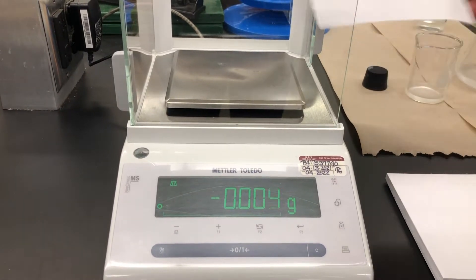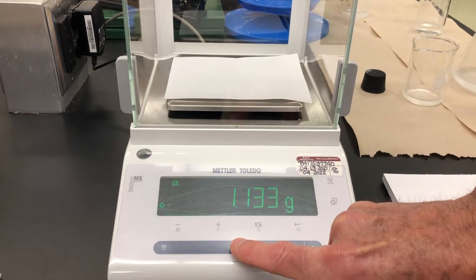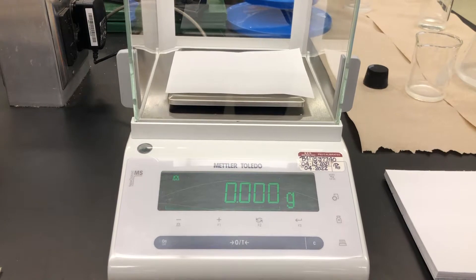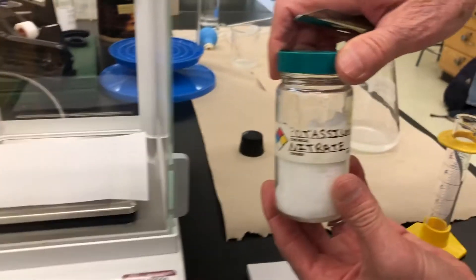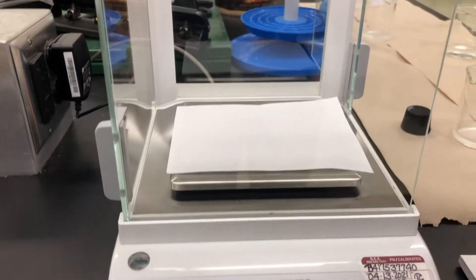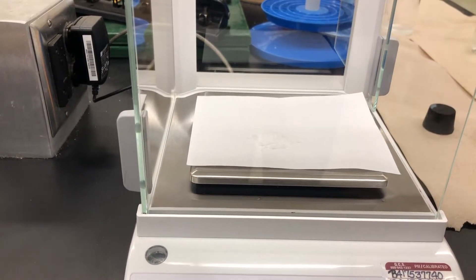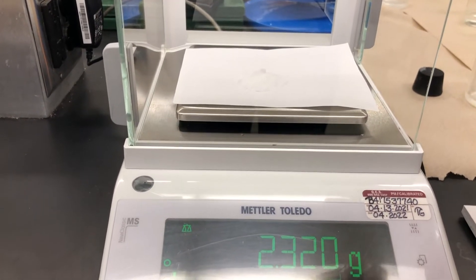We're starting the experiment by measuring out some potassium nitrate. First, we tare or zero the balance with a piece of paper on it. Here's our potassium nitrate — we're going to scoop out approximately 10 grams, and you should record the actual final mass of potassium nitrate that we measure out.